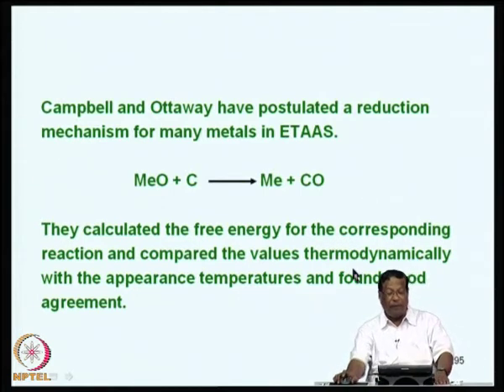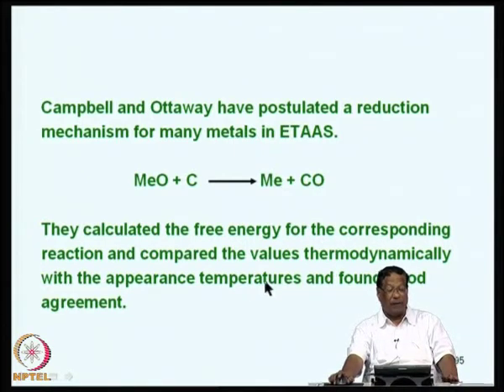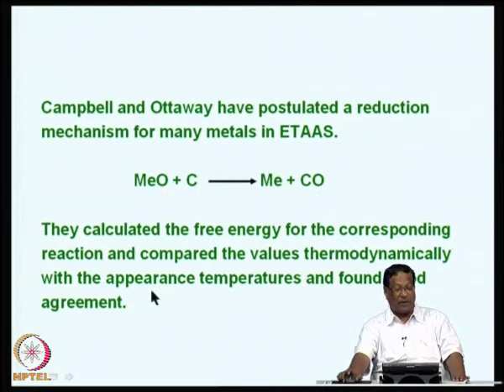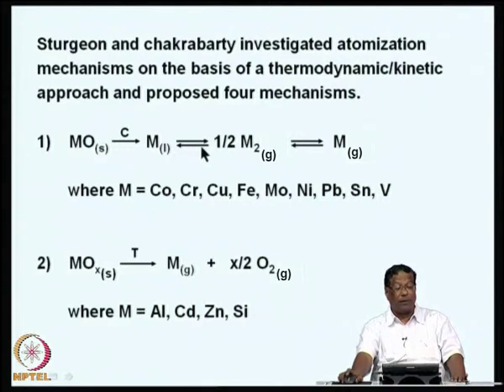They compared these values thermodynamically with the appearance temperatures of the metals and found good agreement. That means most of the reaction products would be metal and carbon monoxide in atomic absorption.